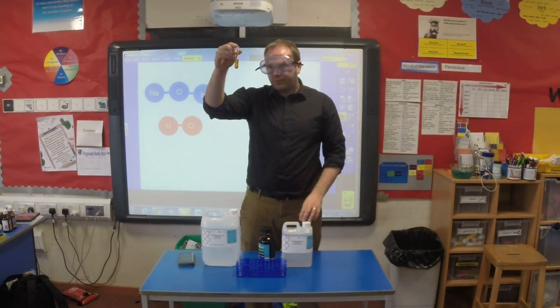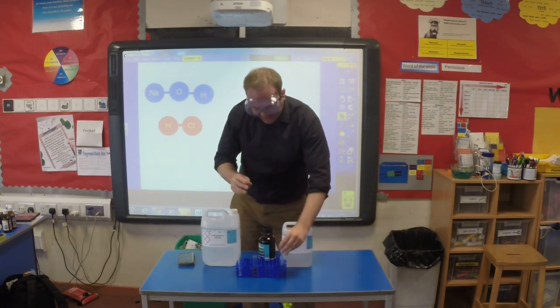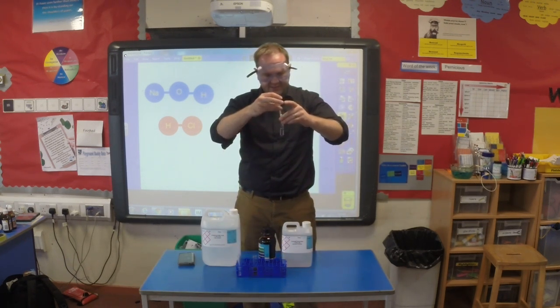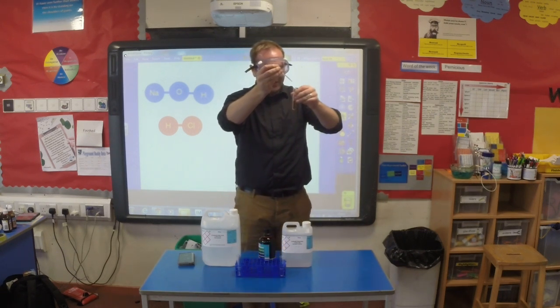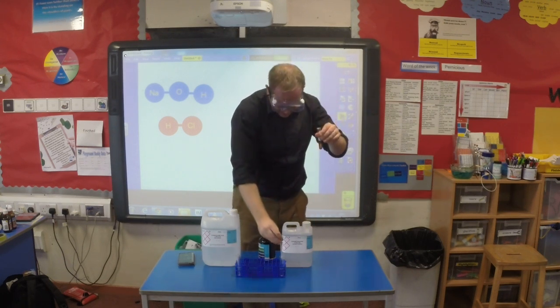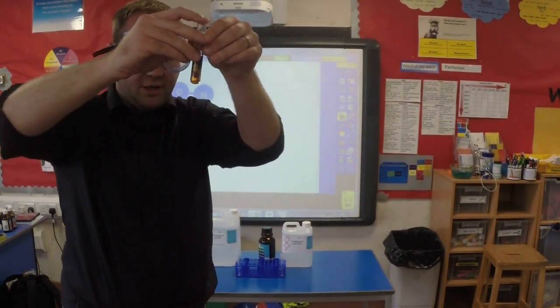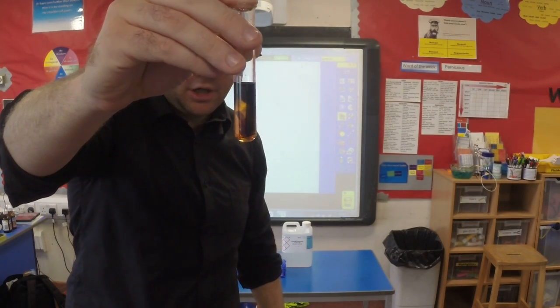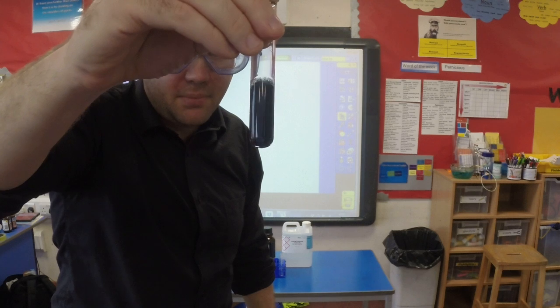Okay, so that's clearly our acid in that test tube. Now, again following a strict procedure, we're going to put exactly the same amount of the base, the alkali, into it. So one drop, and this is where they find out what actually happens. We can see it's gone a little bit of dark coloration, a bit blue at the top.